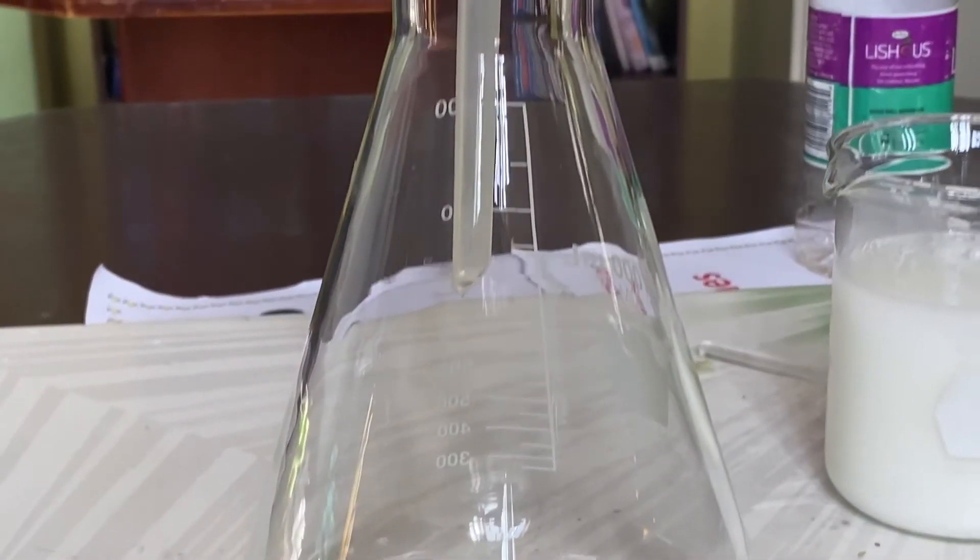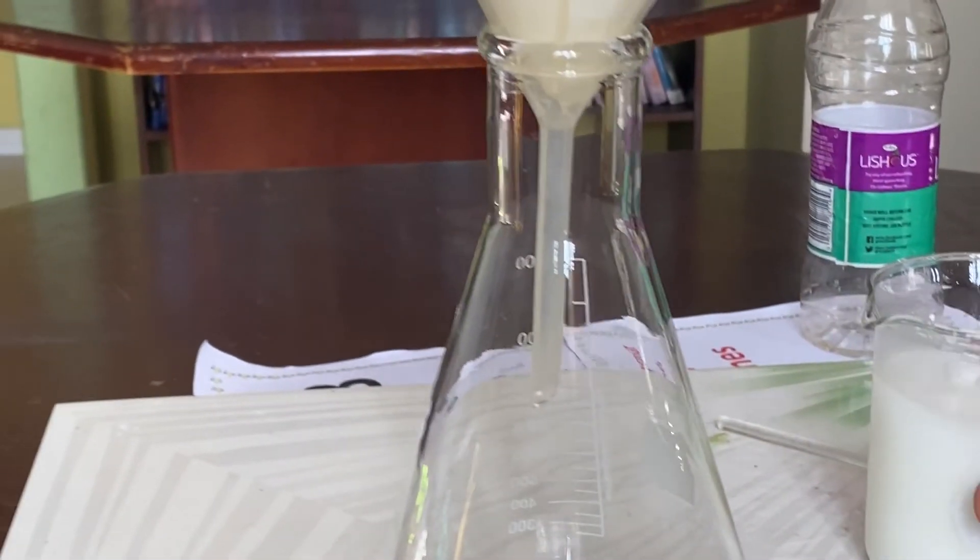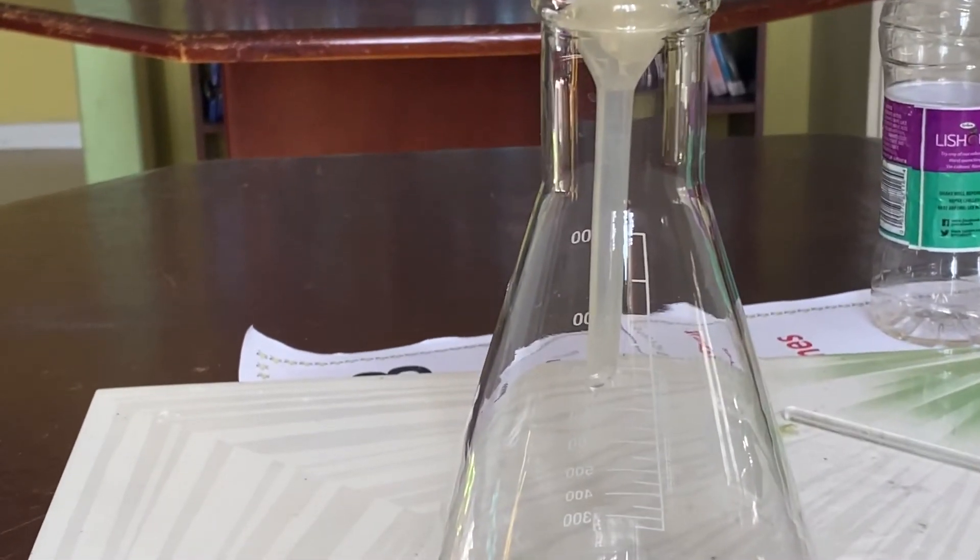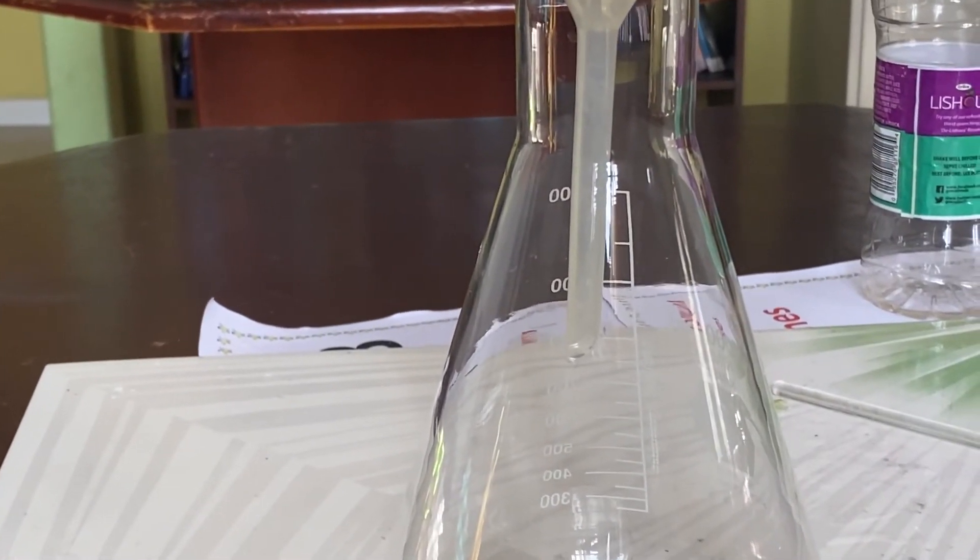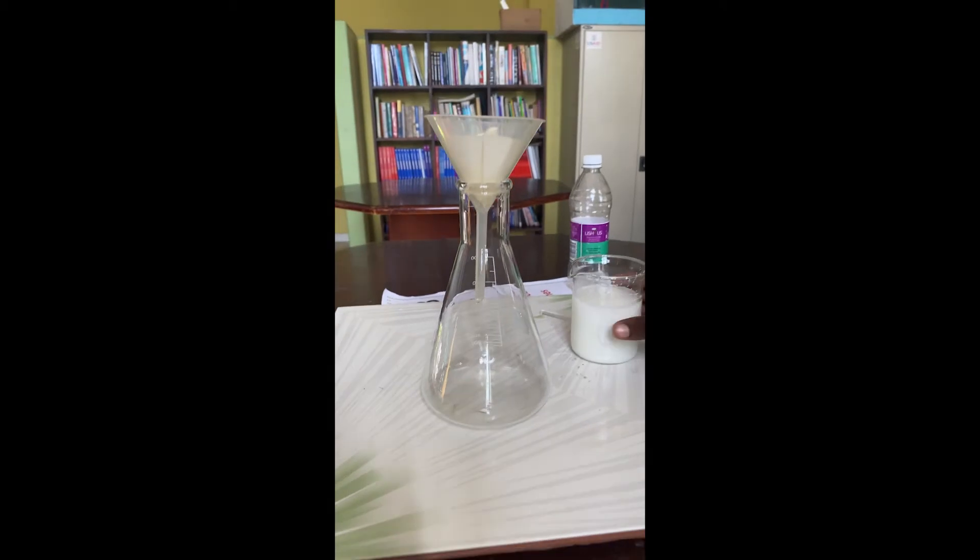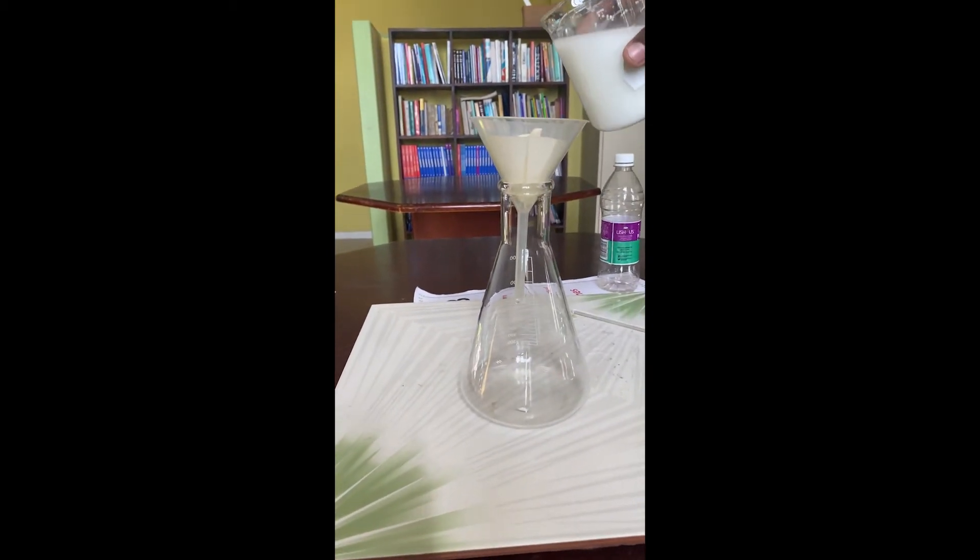To start the experiment, we place the filter funnel into the beaker and place the filter paper into the funnel. We then pour the starch mixture into the funnel and wait until the separation takes place.